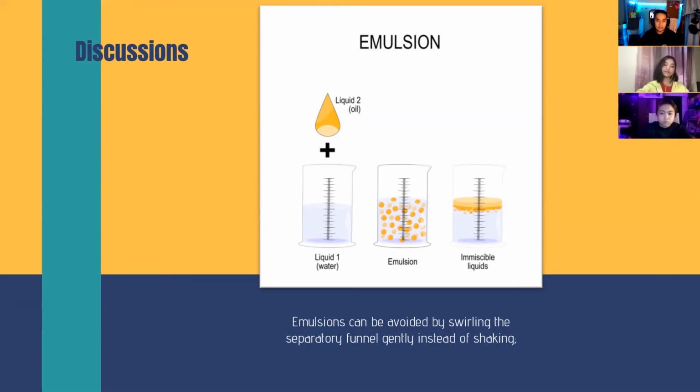If an emulsion has already formed, it can be disrupted by adding brine or salt water that increases the ionic strength of the aqueous layer and separates the two phases. It can be separated through filtration via a glass wool plug, which removes the emulsions, or a phase separation filter that isolates a specific layer. It allows either aqueous or organic phase to pass through and be isolated. Moreover, the addition of a limited amount of a different organic solvent, which alters the solvent properties of the separation, could result in a surfactant-like molecule which breaks the emulsion.